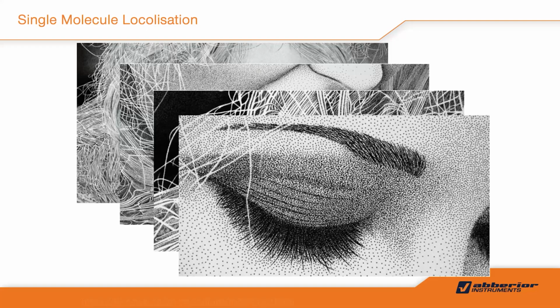Then it takes another maybe half an hour to calculate the position of each dot, or to do the mathematical correction of the shift or the distortion of the light, then to calculate the position. So it takes a long time to generate one image in PALM and STORM.